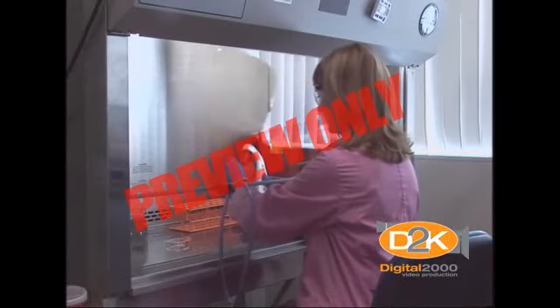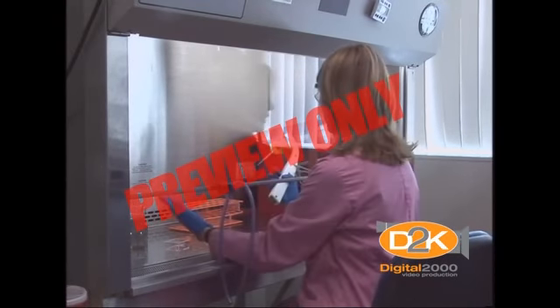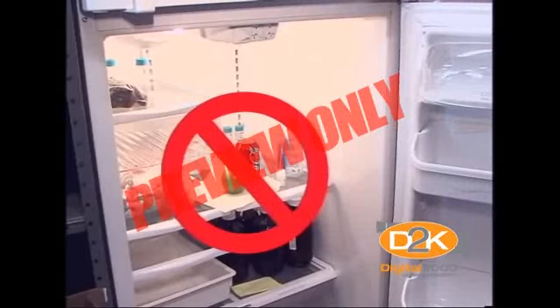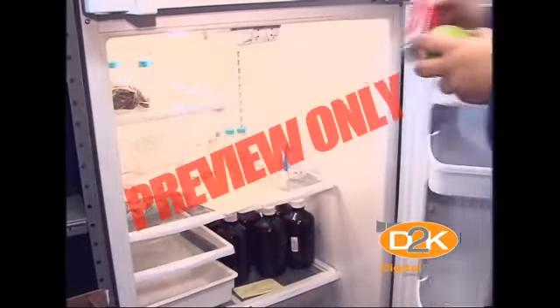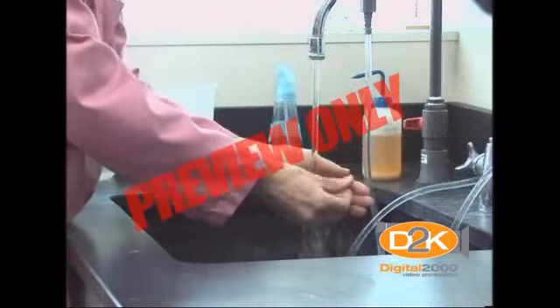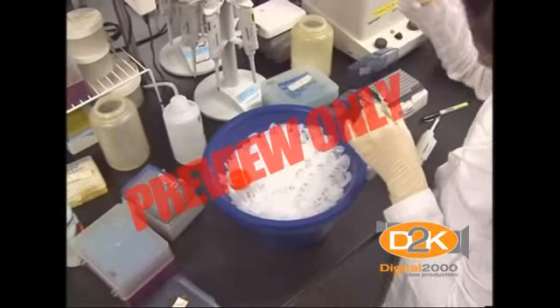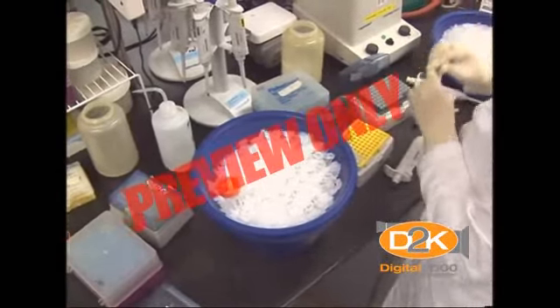Direct ingestion may occur as a result of the outdated and dangerous practice of pipetting by mouth. The technique of mouth pipetting should never be used. The risk of ingesting hazardous chemicals may be reduced by not eating, drinking, smoking, applying cosmetics, or storing food in the laboratory. You should always wash your hands thoroughly after working with chemicals, even when you have been wearing gloves. Percutaneous exposure may result from a needle stick, puncture with a contaminated sharp object, or through wounds or abrasions.